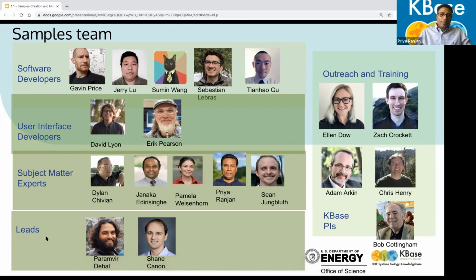Yeah, it's definitely a work in progress, but it has a lot of the fields that Enigma people would be interested in. So, as Shane said.